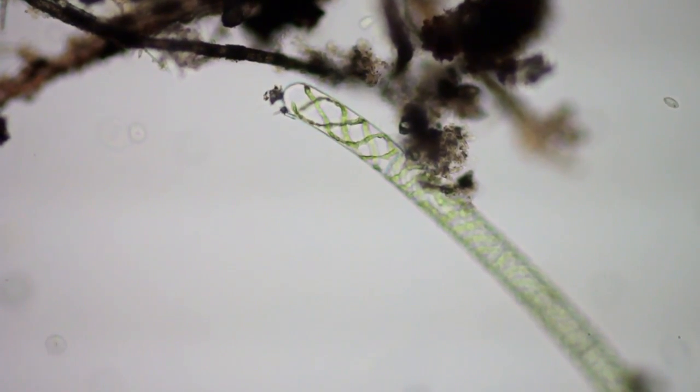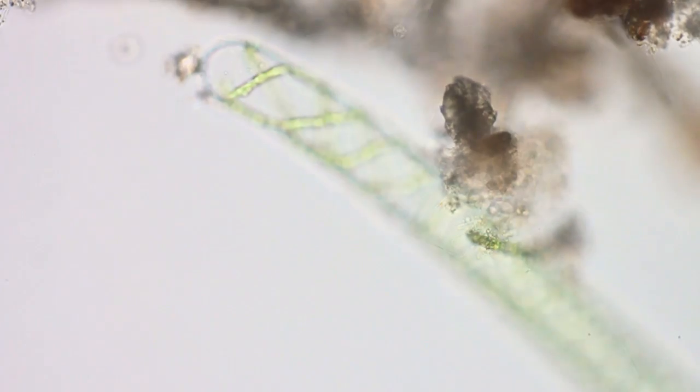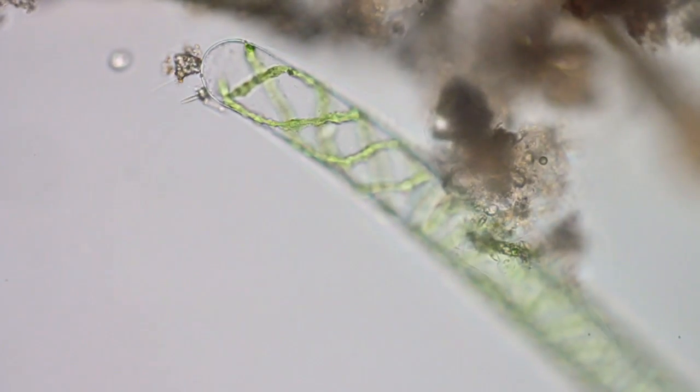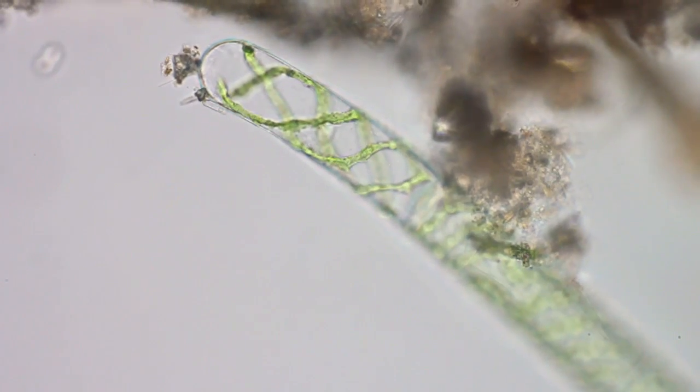The vibrations are caused by the cover slip floating on the water. Any little vibration causes it to shudder. This is probably cars going by on the highway outside.